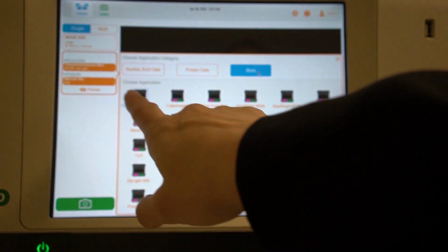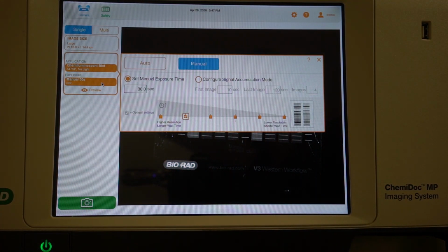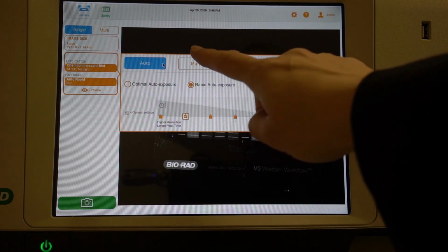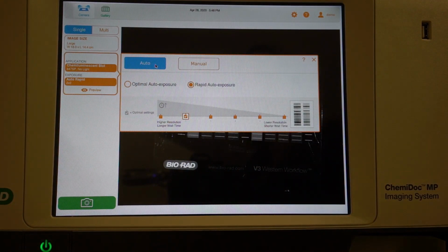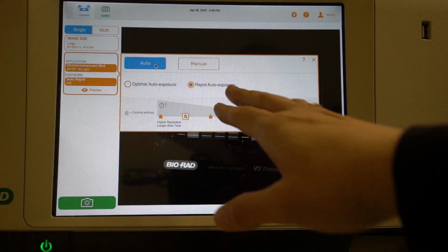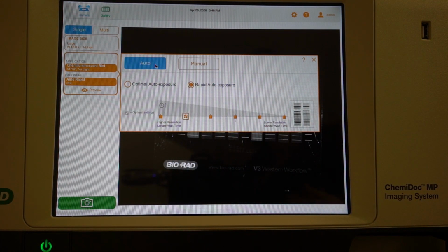So as you move your way down, here is your exposure. So this is where you can tell the imager how you want to take that picture. There is an auto setting and a manual setting. So the auto setting allows the imager to take an image, either optimal or rapid. So a rapid image is just going to take a quick and dirty picture, the best it can do, as fast as it can be to get a good image.